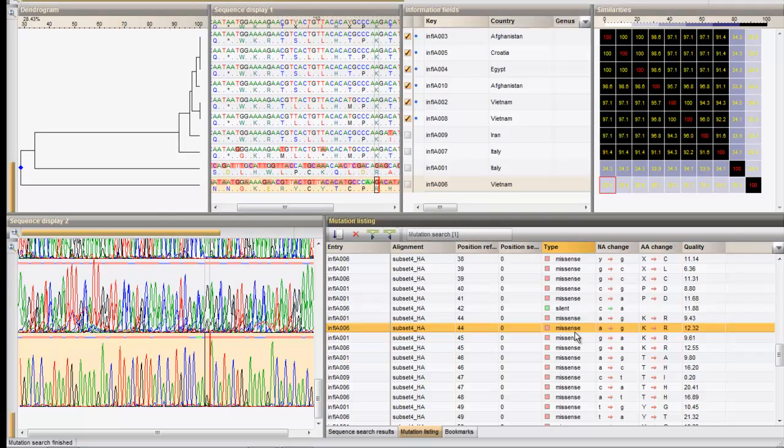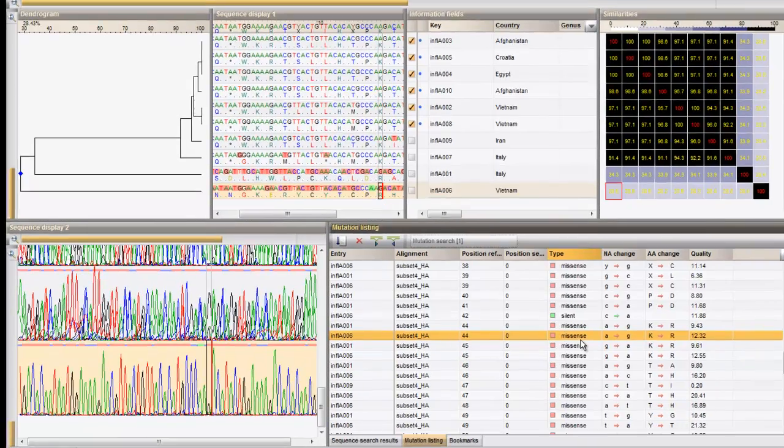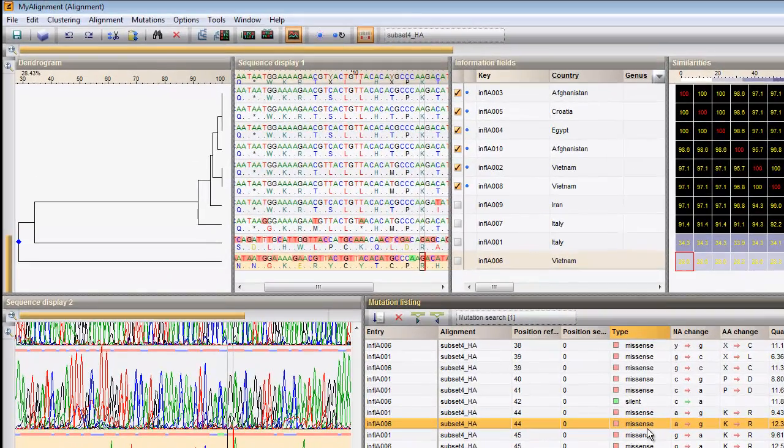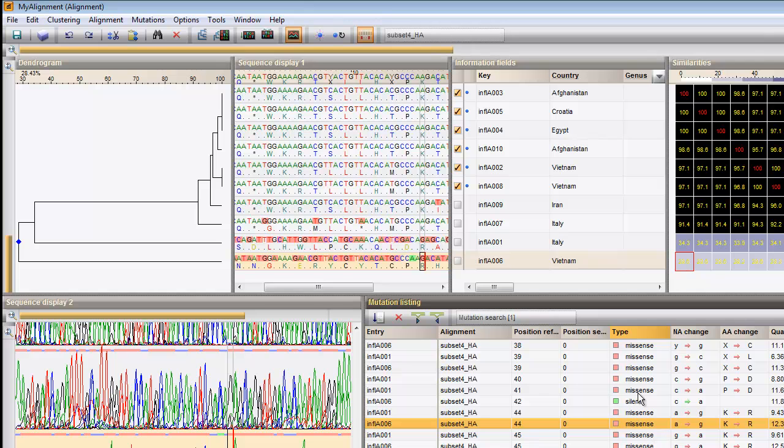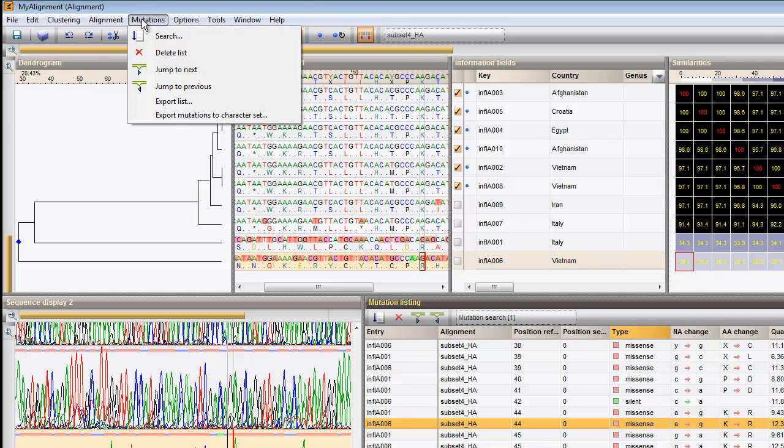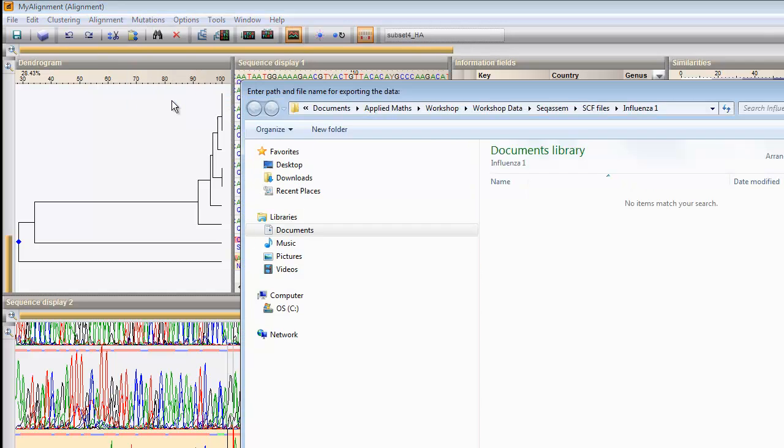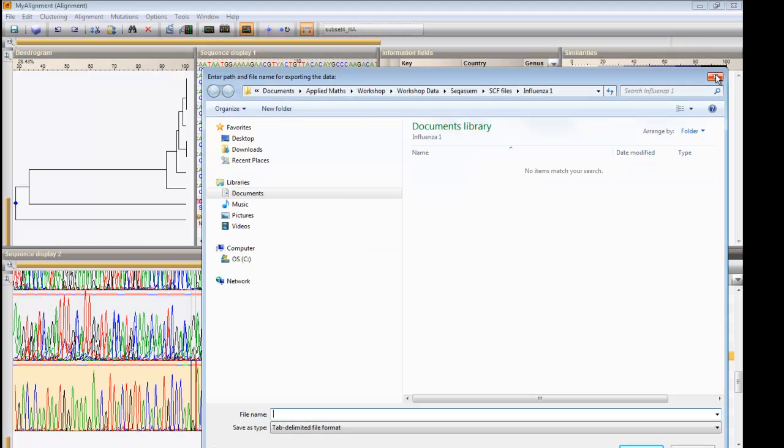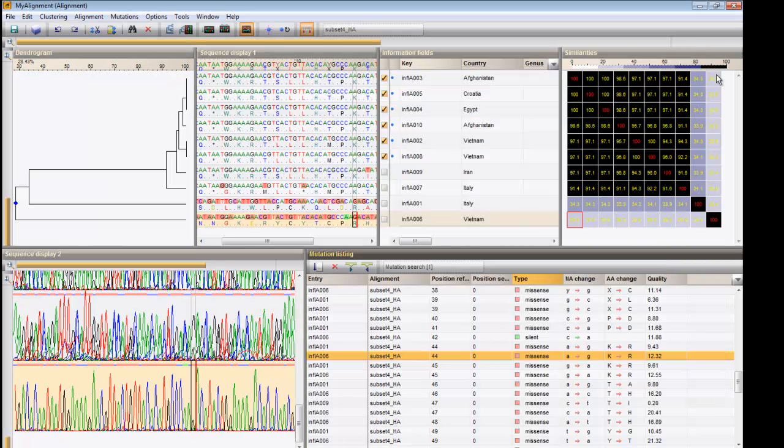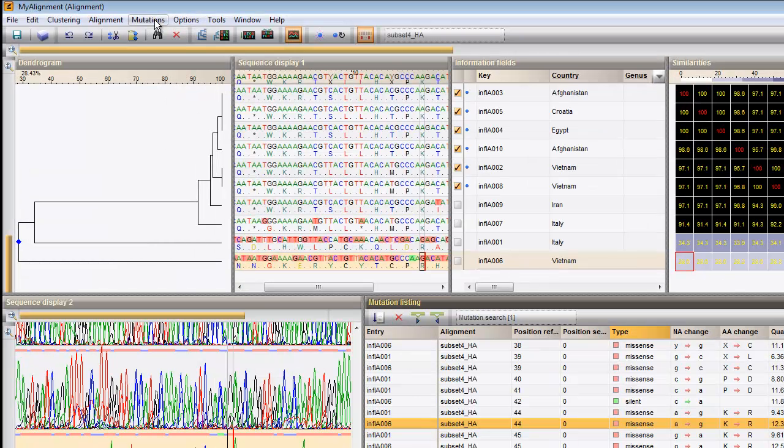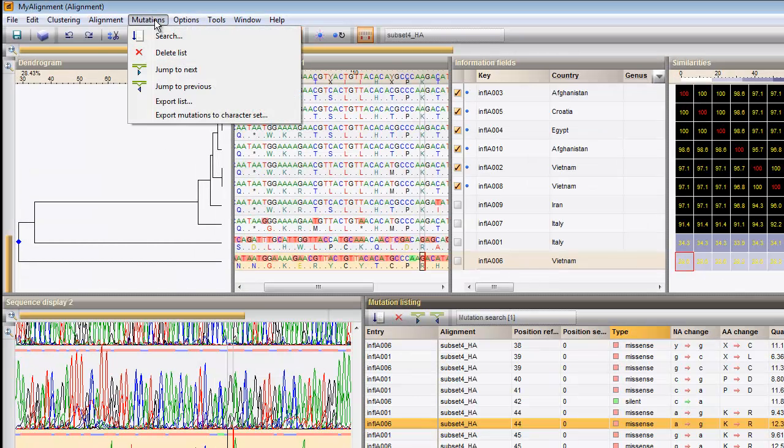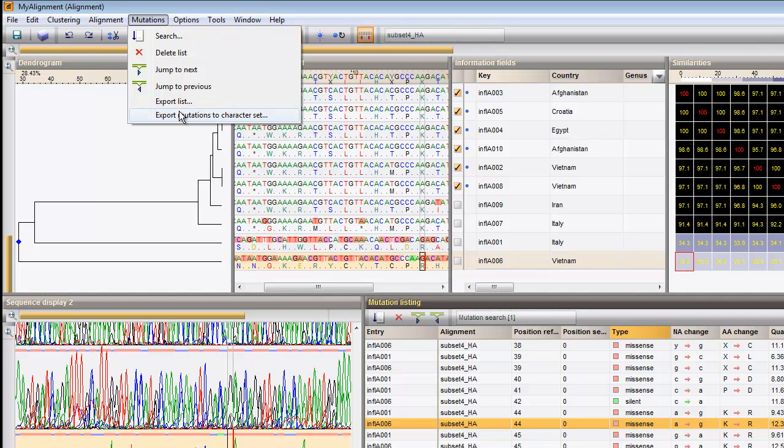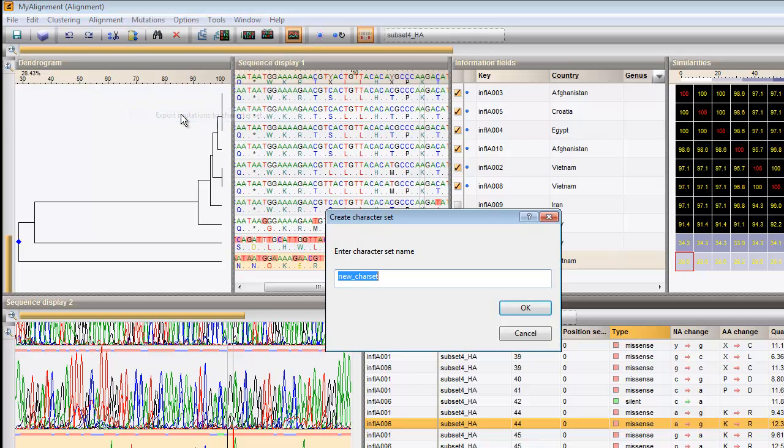Mutation lists can be exported with mutations export list, or directly into a character experiment with mutations export mutations to character set.